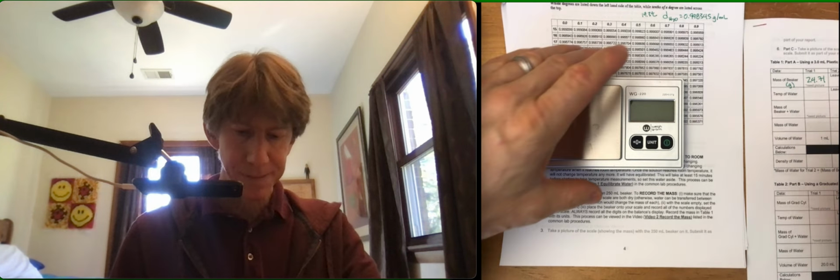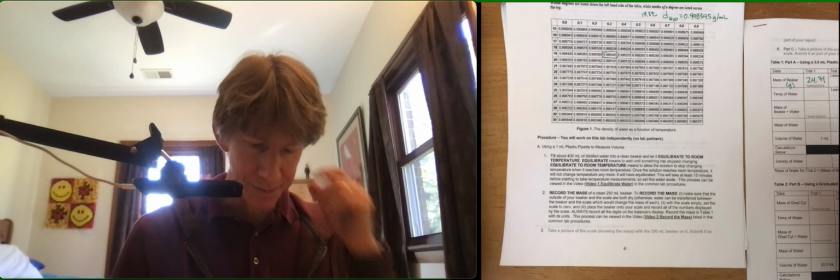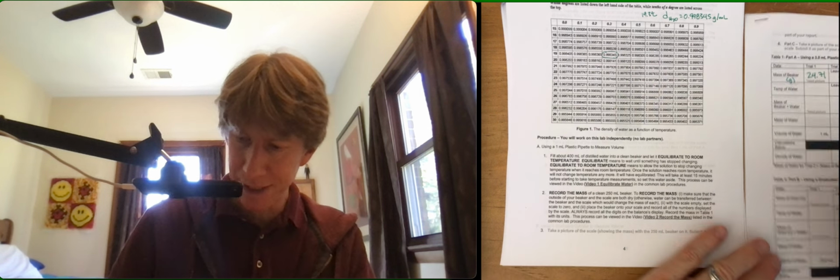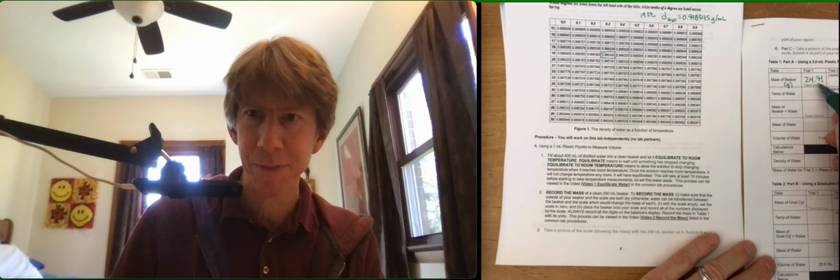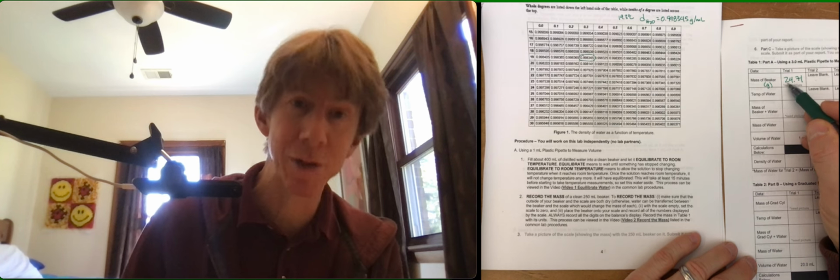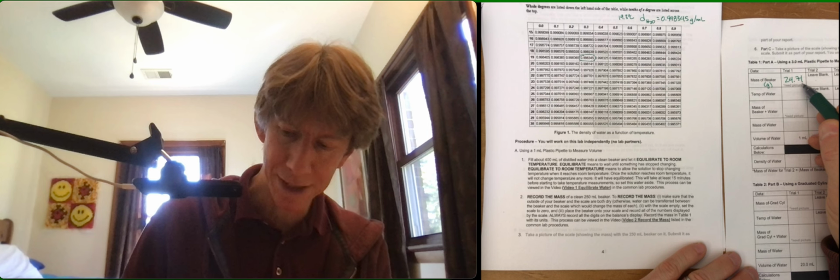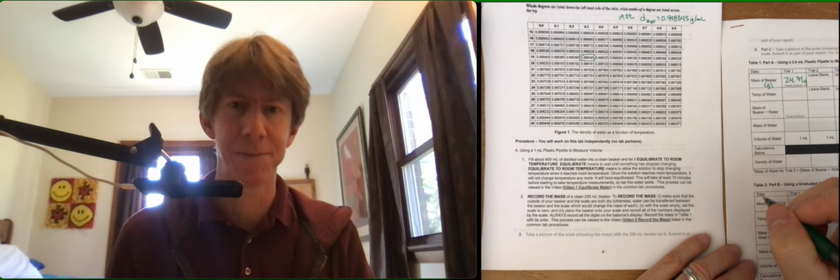All right. So I've got that, record the mass, take a picture of the scale showing the mass, please do that, and you'll see it says need picture in this little box here, in green if you print it out in color on your screen, 24.71 grams, and you can put the G there too if you prefer.